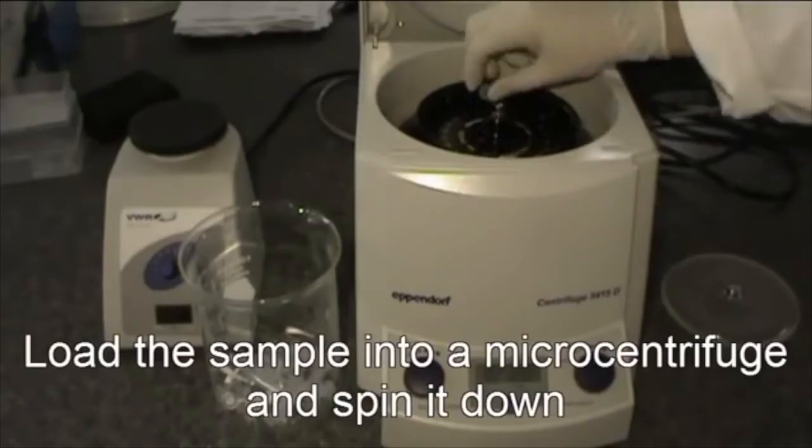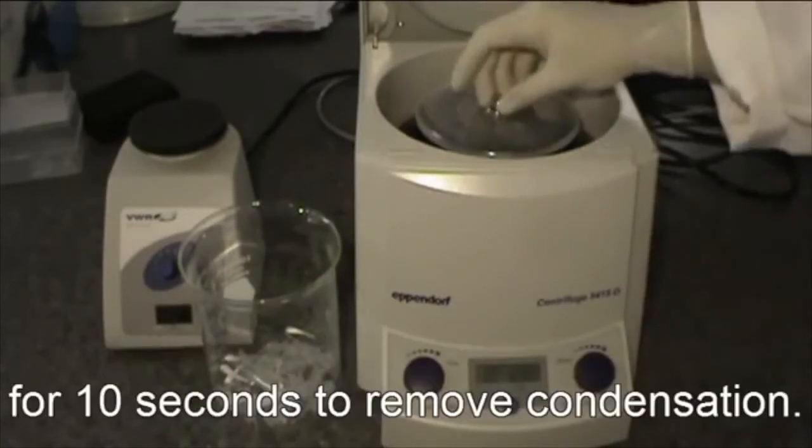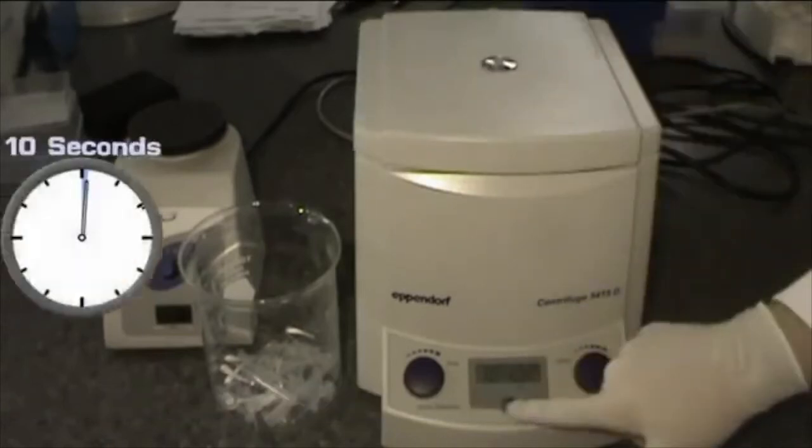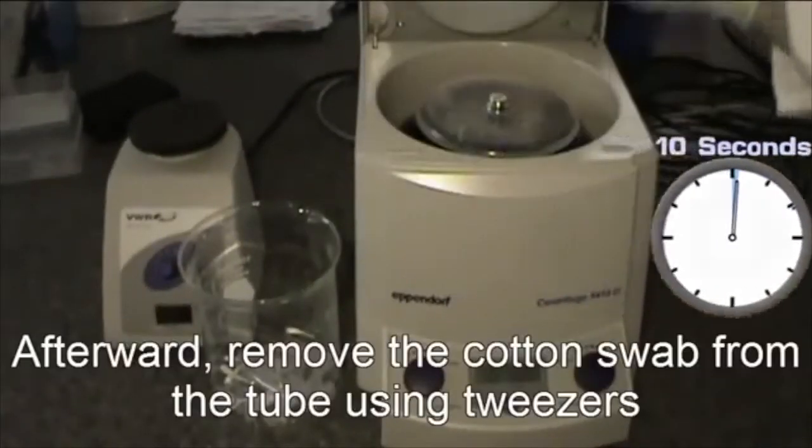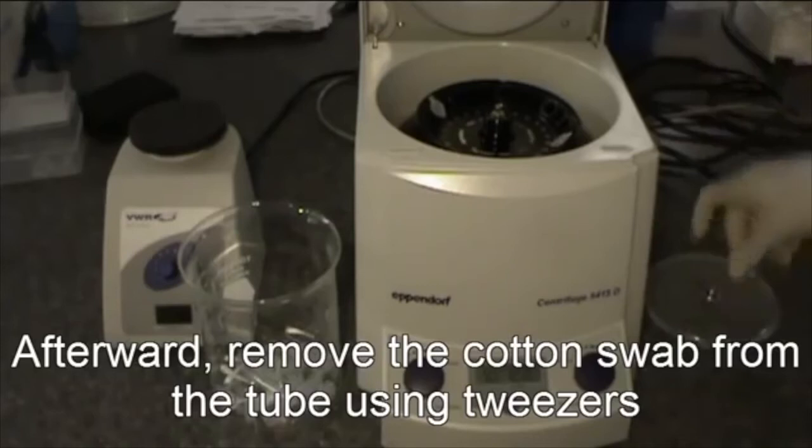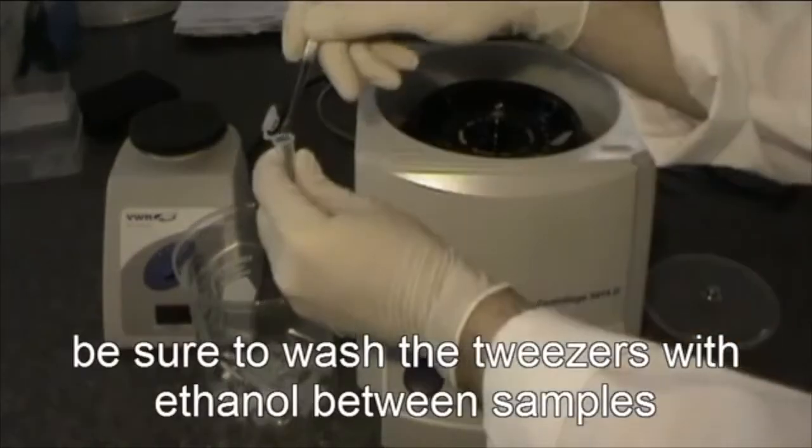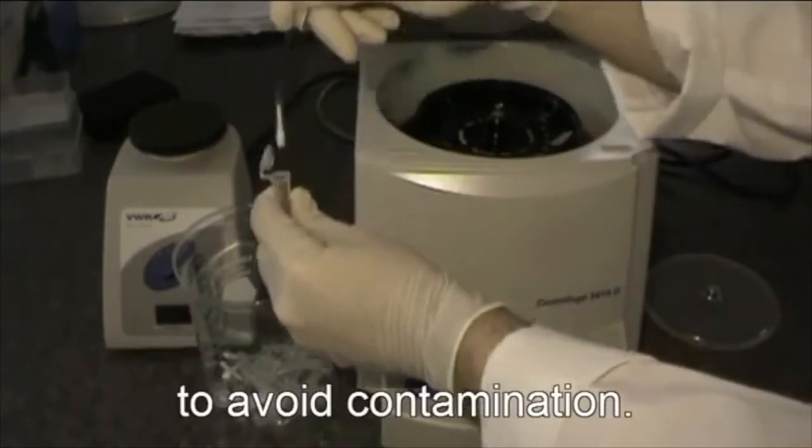Load the sample into a microcentrifuge and spin it down for 10 seconds to remove condensation. Afterwards, remove the cotton swab from the tube using tweezers. Be sure to wash the tweezers with ethanol between samples to avoid contamination.